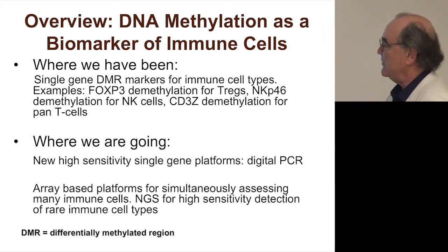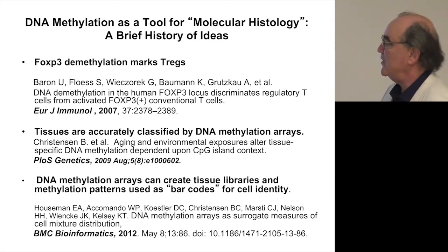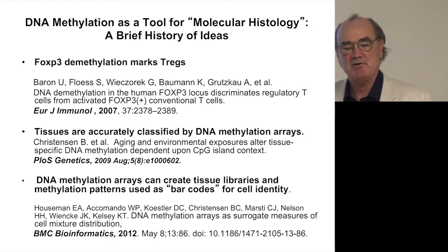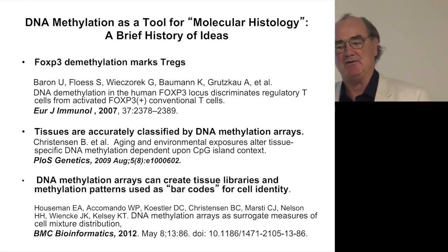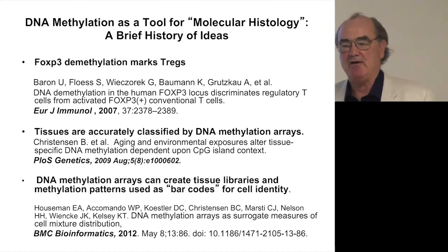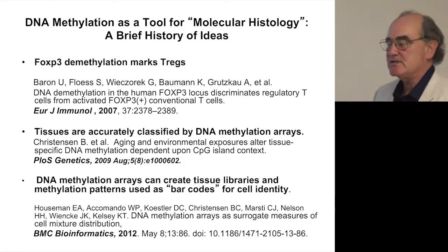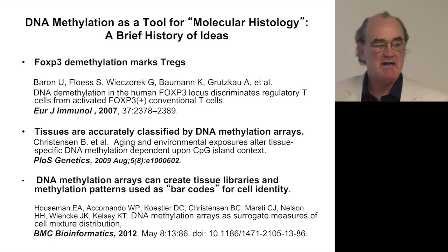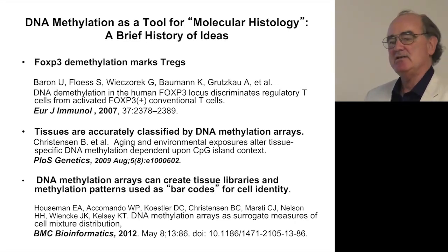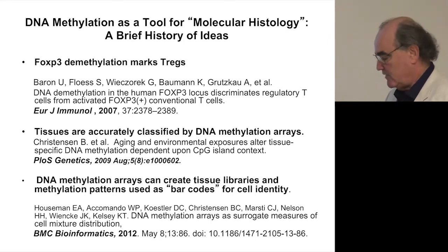And a few years ago, and I think I've got something a little bit more of a historical presentation here, we were aware of studies coming from Germany on an approach which seemed, frankly, sort of radical. This group claimed that you could look at the promoter of a transcription factor called FOXP3, and the methylation status of that promoter was very specific for a very important kind of immune regulatory cell called T regulatory cells.